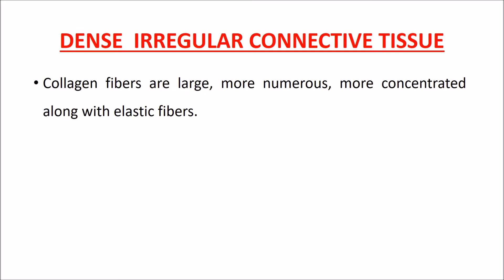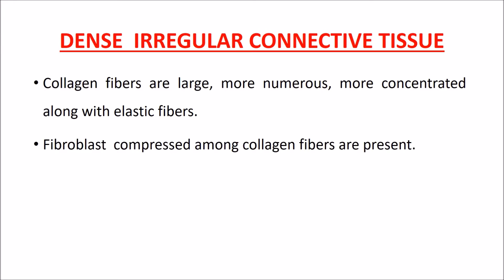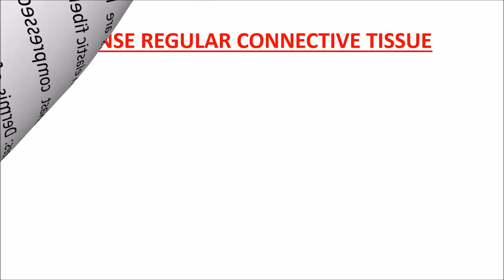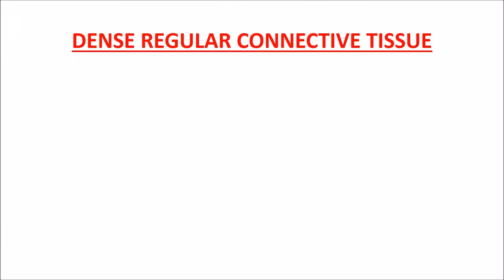Dense irregular connective tissue: collagen fibres are large, more numerous, and more concentrated along with elastic fibres. Fibroblasts compressed among collagen fibres are present. Examples include the dermis of skin and interlobular connective tissue of mammary gland.